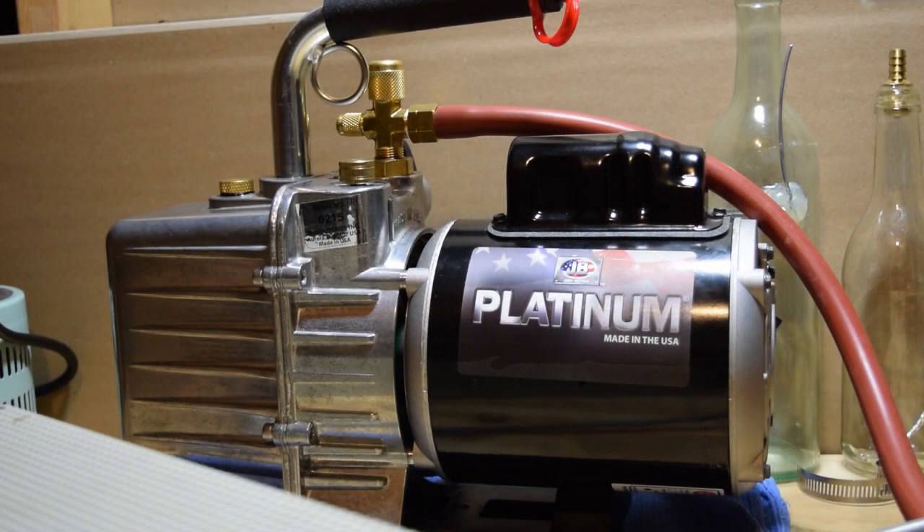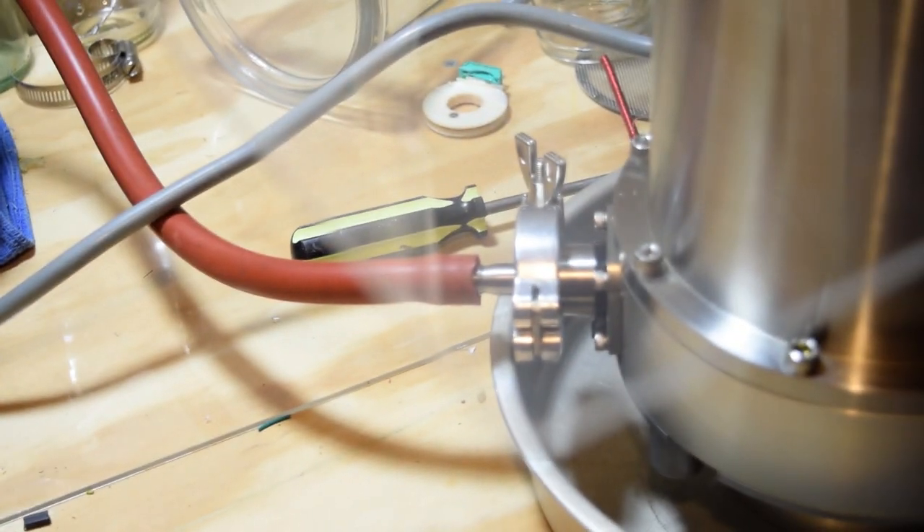This is the roughing pump that I'm using. It's a JB Platinum vacuum pump, connected to the turbo pump using a KF flange hose barb adapter.